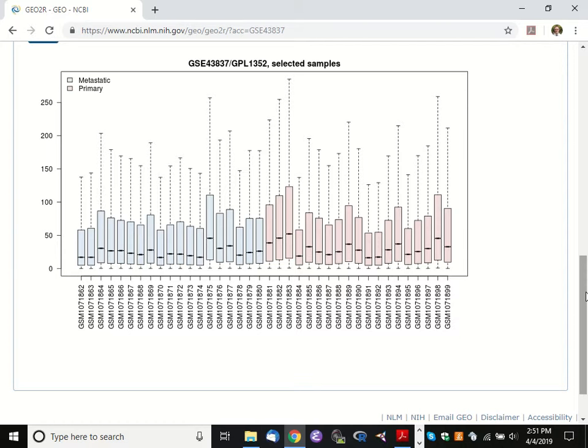Okay? Well, we've got some extensions on here, right? So what we're looking at is the distribution of intensity values for each microarray. But there are 60-some thousand intensities here. So this is a distribution that's got a whole lot of points below it.